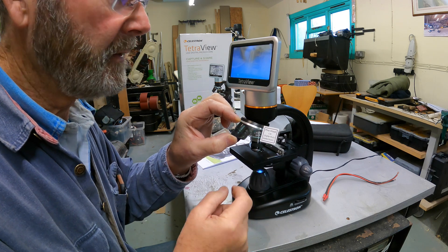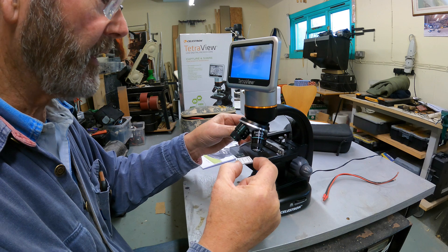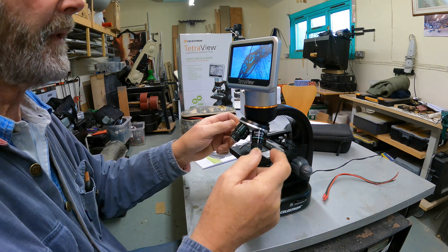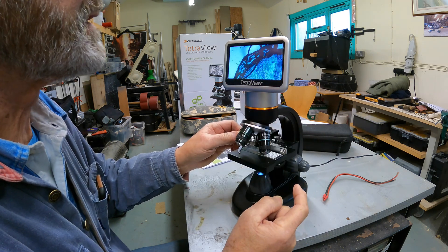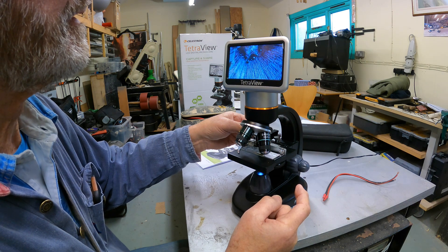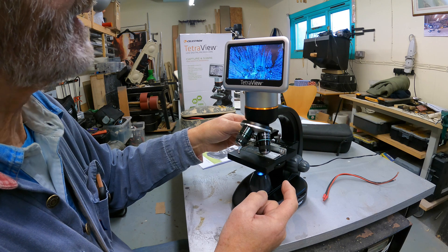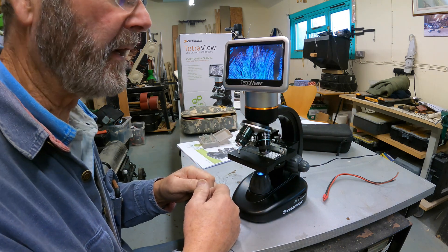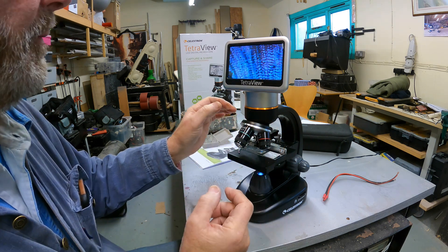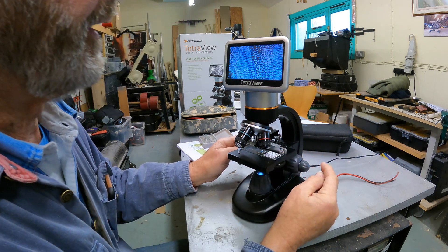I've selected a specimen - it's described as pine wood on its glass slide. I'm going to put that onto the stage, hold the spring back, and put it into position. You can see on the screen the specimen is there, and we can move the stage to center it. I've got it on the 40 times magnification. If I rotate it to the 100 times magnification - there we are, you can see we've got a closer view, and we may have to focus it again using the smaller knob to bring it into focus.